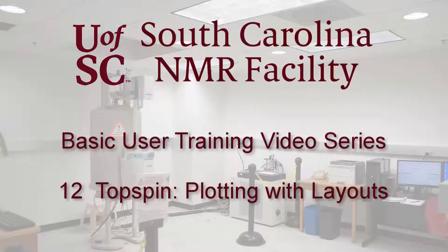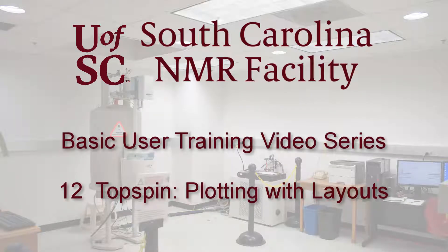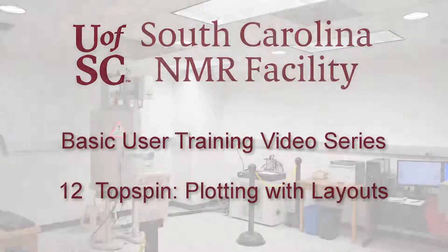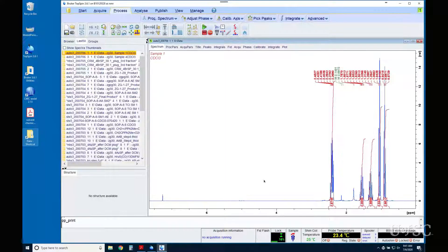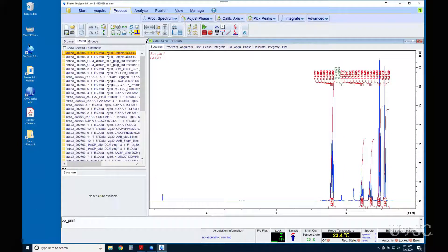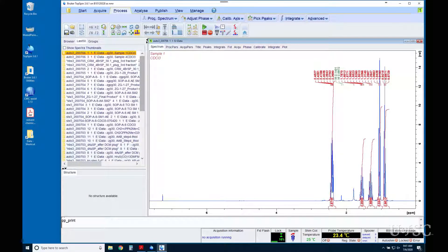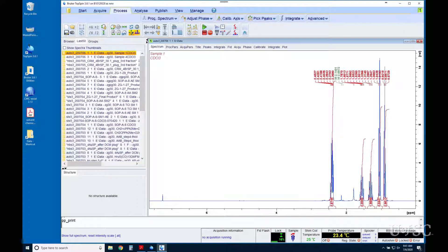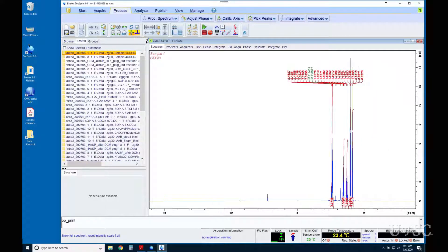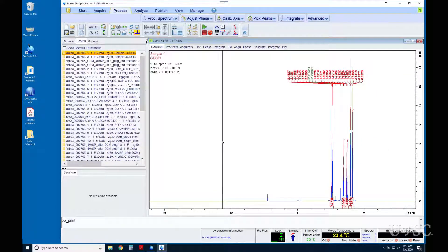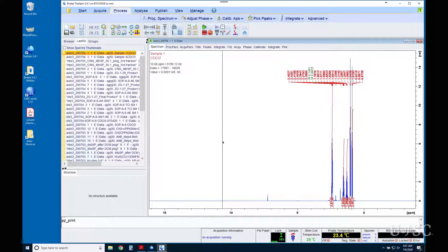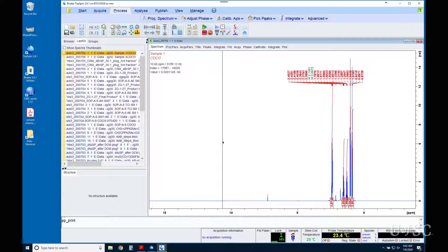In this video we will show how to use predefined layouts for plotting NMR results with Topspin. Plotting in Topspin can be quite complex. The plot editor is somewhat challenging to work with, but it is very customizable. We will try to cover some of what the editor can do in a later video, but for now we are recommending that you start plotting with our predefined layouts.